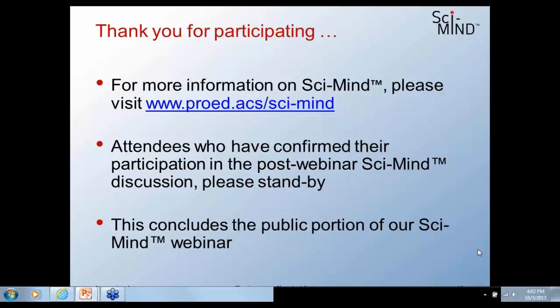And very often, I think about those regulatory and compendial methods, at least as an academic I can do this, as the place to start. And you'll get a lot of good ideas, a lot of background method information from that. But today I would not go to the USP and take a method right out of the USP, for instance, and just use that method blindly. Not today, because it probably is using a column that was developed 20 years ago, and the columns today are much better. But I would certainly use that method and those conditions as a starting point for my own development and validation. I think that is actually still a very good thing to use.